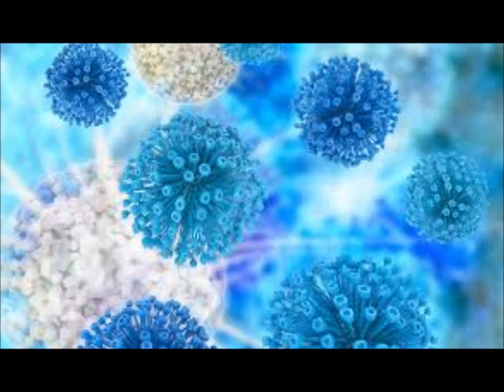It's its own little column. On the gram stain sheet, if it's greater than 10 squamous under low power, the first thing you see, isn't there a section down there with enumeration on sputums? Does it say greater than 10, less than 10, greater than 25?